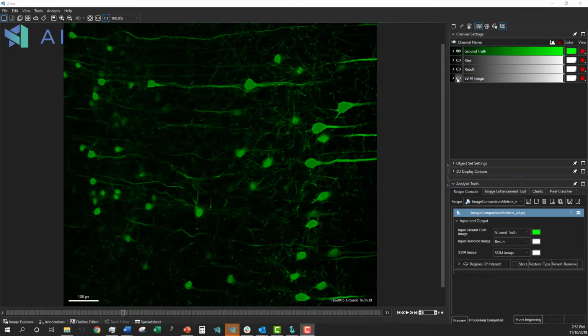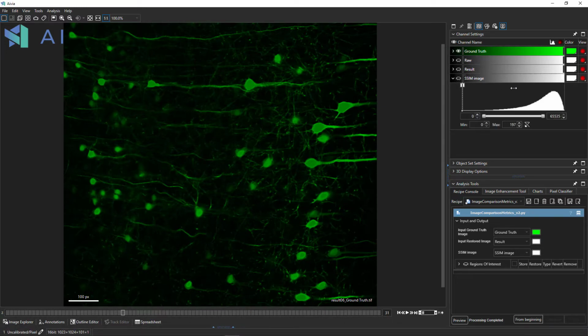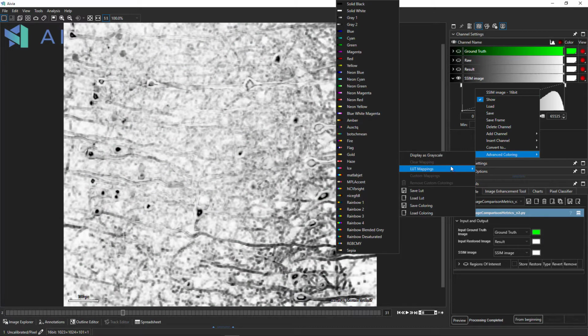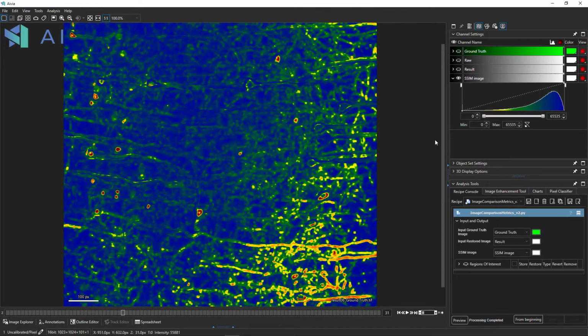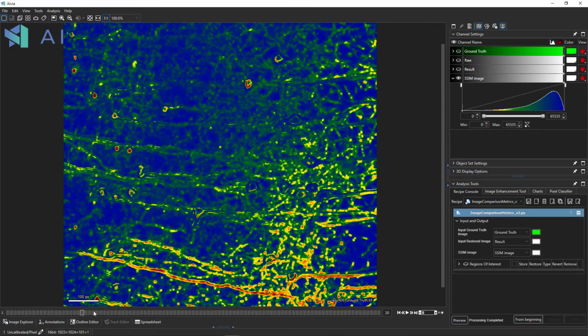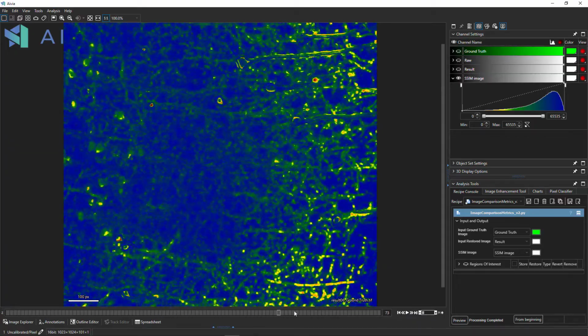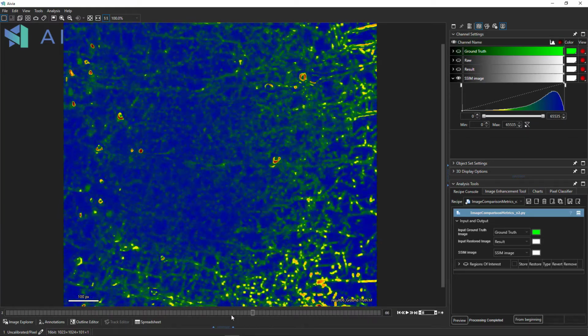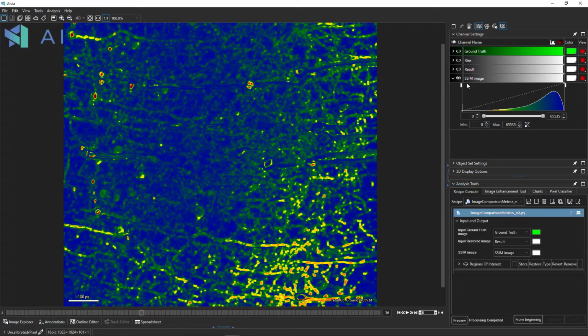Okay, that's complete. You can now have a look at the result here. So let me turn this off. It helps to have a color map that is a little bit more indicative. So rainbow 1 is good. If it's a very low intensity value, it means low confidence or high disagreement. So this is low quality. Everywhere you see these kinds of colors, and red more specifically, indicates that there is disagreement between ground truth and the reconstruction. But generally it's in the blues and greens, which means there's a big agreement between the two images, between the ground truth and the restoration.